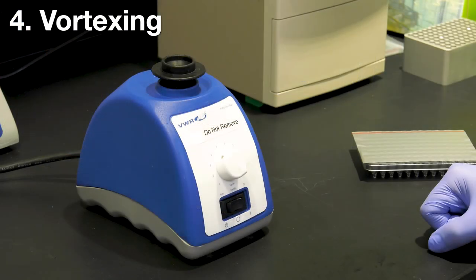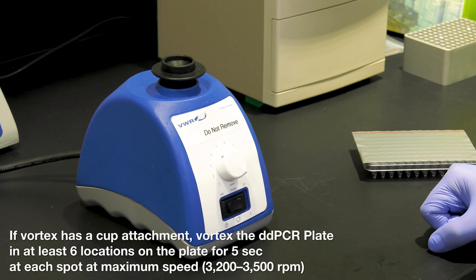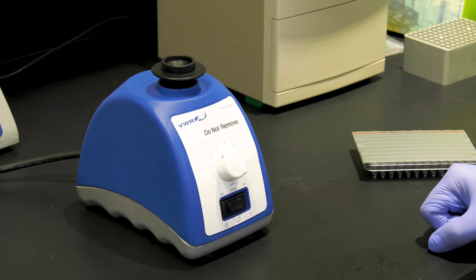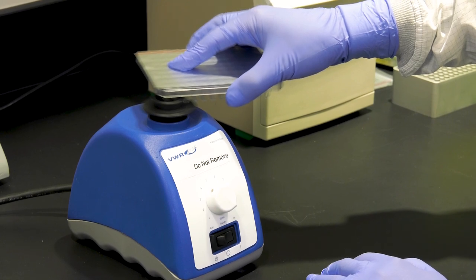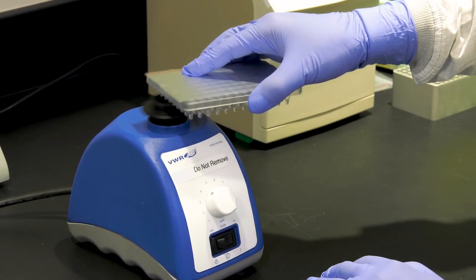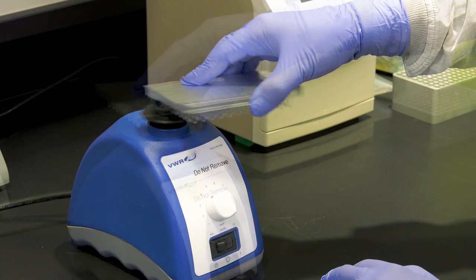To mix the reactions in the sealed plate to ensure that they are homogenous, you can use a vortexer with a small, cup-like rubber head attachment. Again, make sure it is set at the maximum setting, which should equate to 3200 to 3500 RPM. Turn on the vortexer and vortex the four corners first for about 5 seconds each, making sure that you are mixing really well.